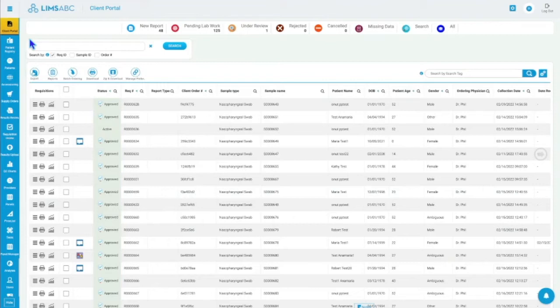The other thing is we have an application for your doctors to come in and sign requisition forms, right? So let's say a nurse places 10 orders, 50 orders in a day, then the doctor can come back at the end of the day and sign them. So you have that signature on your requisition, so you can actually do billing. But I'm going to focus on the ordering and result reporting, right?